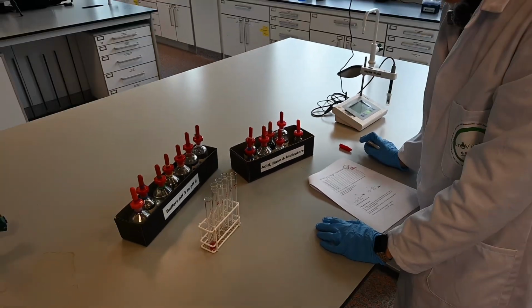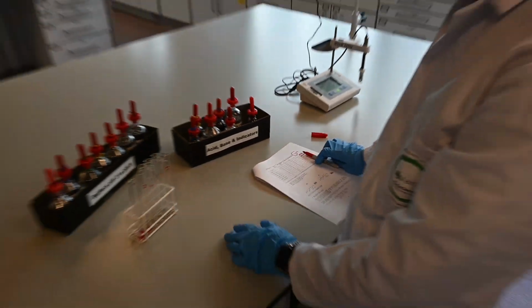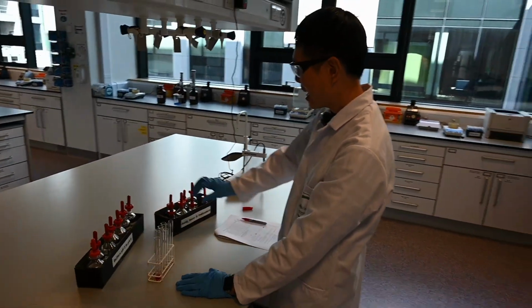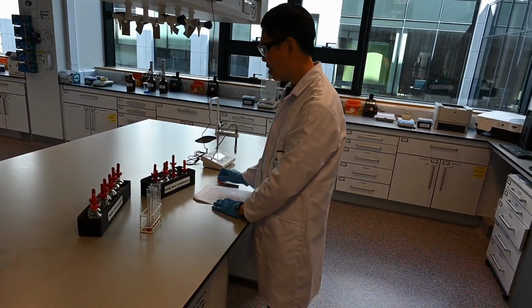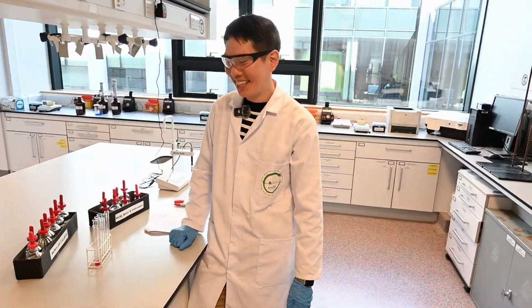So you see, just keep on doing this with different buffer pH. It's not too hard, right? And then you get different colors here. After that, just make sure you have clean test tubes and repeat the process for other indicators. Very simple. I wish you good luck. Have a rainbow. Bye.